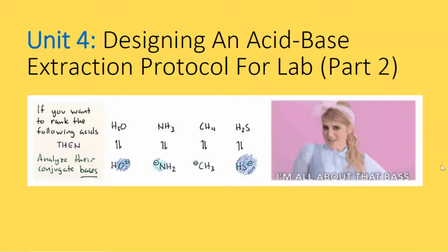Welcome back. This is part 2 of designing an acid-base extraction protocol. I know part 1 was longer than usual, but we accomplished so much in part 1. We were looking at using 2 different bases, and I think we have an idea now which one to use first, which one to use second.